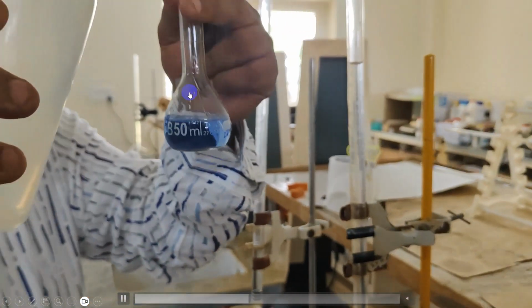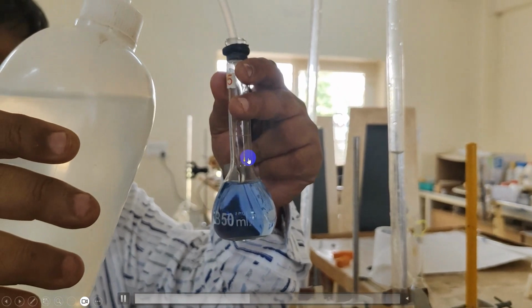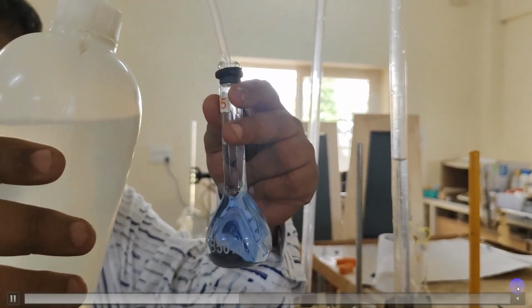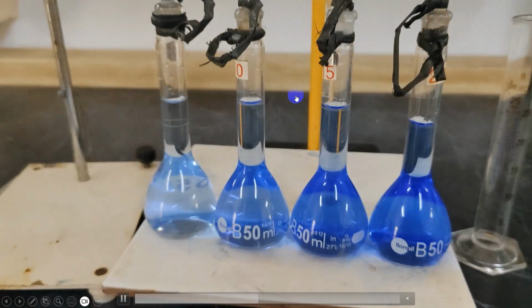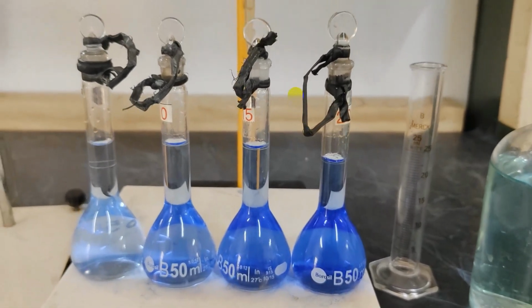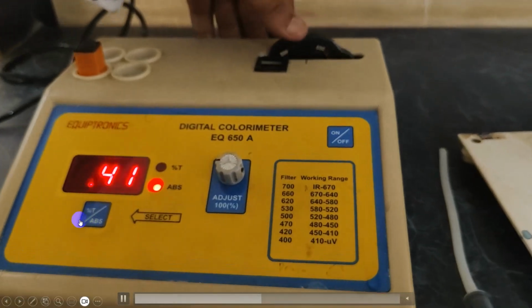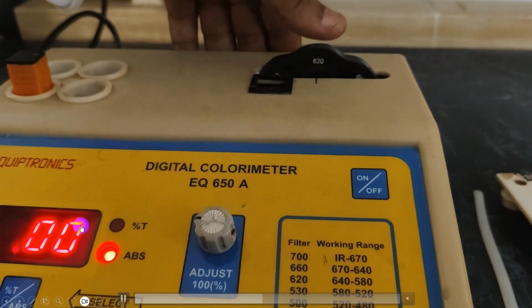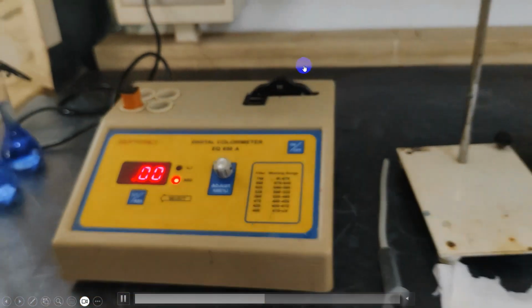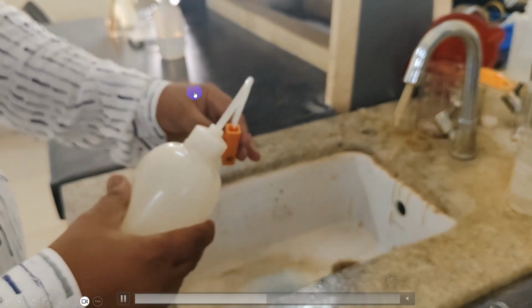Now make up the standard flasks with distilled water. In the same way, make up all the standard flasks and you can see the change in the color intensity. The one which had the lower volume of copper showed a lighter color. Now adjust the filter to 620 nanometer, because the cuprammonium sulfate complex absorbs maximum at 620 nanometer.